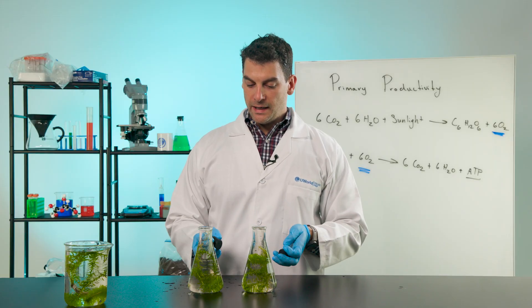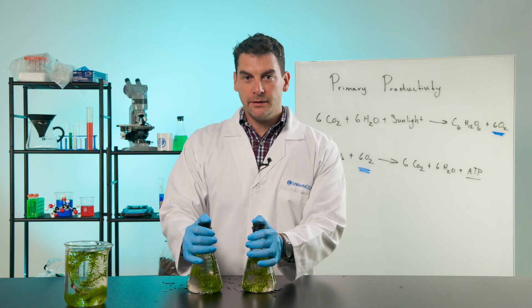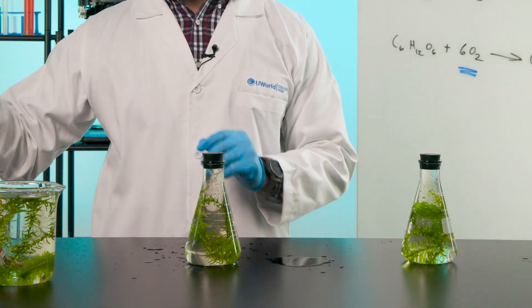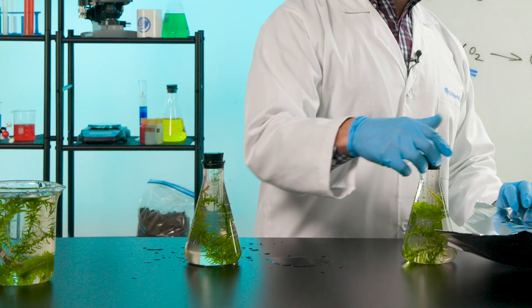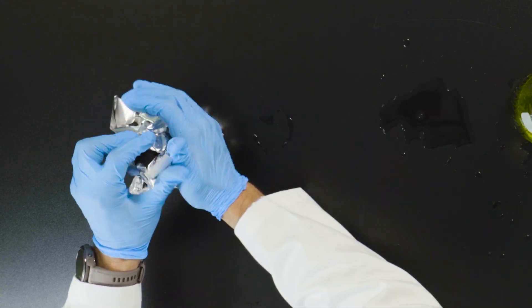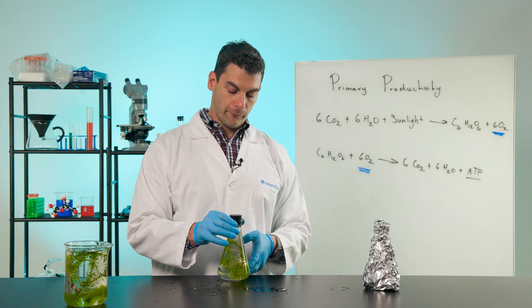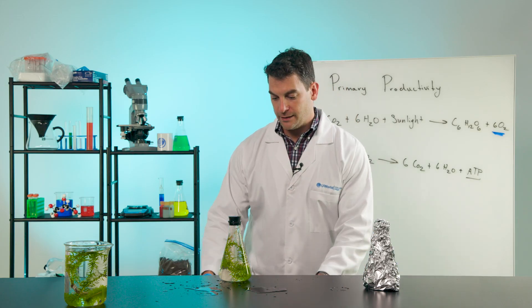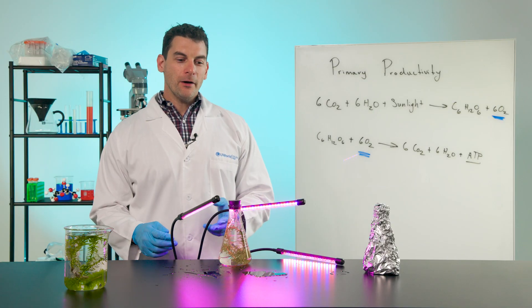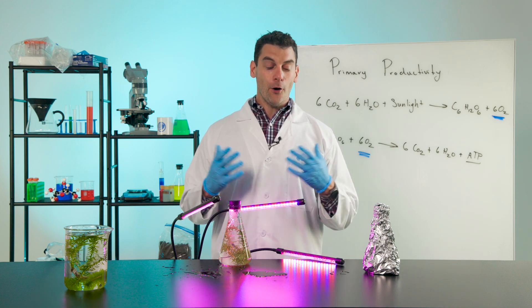Now that the elodia are placed in the flasks, seal everything — it will make a little bit of a mess, but that's okay. Then place the flasks in their respective conditions. One goes into the dark: wrap it in aluminum foil to prevent any light from reaching it, simulating dark conditions. The other is placed under a grow light to allow the elodia to perform photosynthesis. We'll let these incubate for about two to three days.